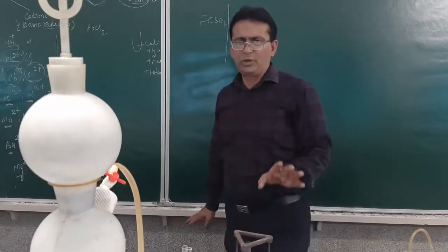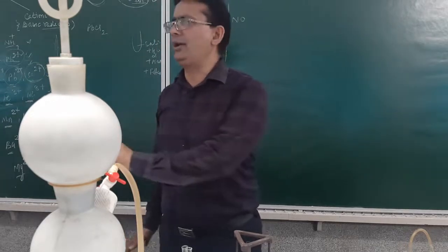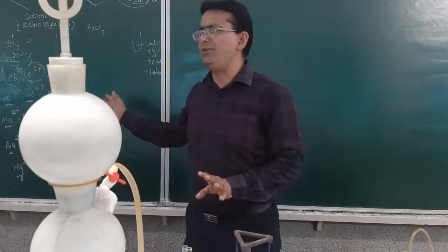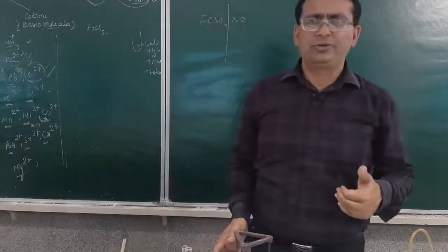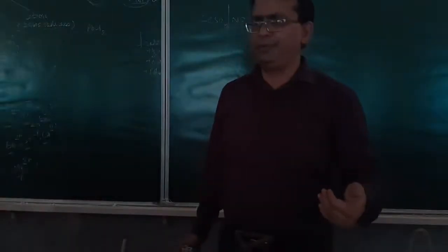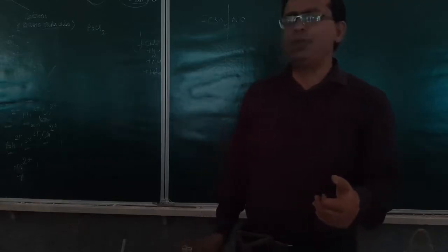Now students, today you have been given the salt just to have a first-hand experience of how to carry out the procedure. Even if you obtain or correctly identify the nitrate and the lead salt, I will suggest you go through the process so that you get comfortable whenever you come next to the lab. Am I clear? With this, I hope you will do your work properly, so you may start your work.